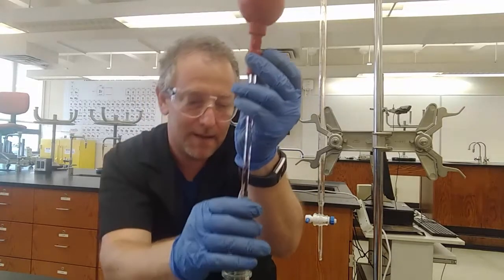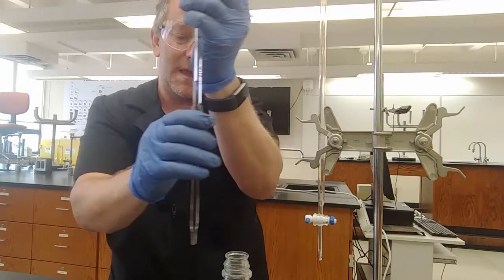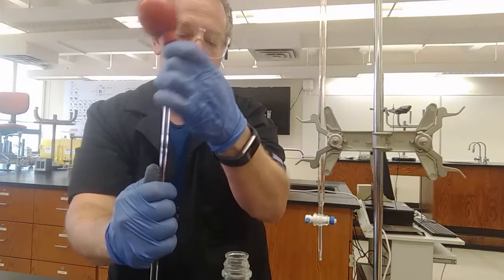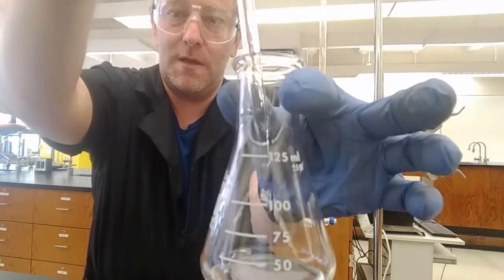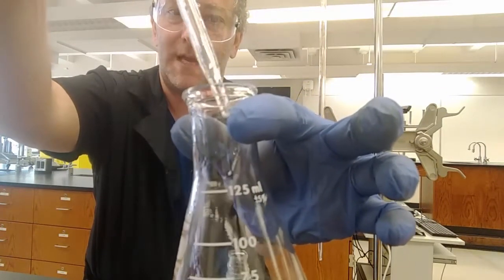Exactly on the line. Carefully take it out, no letting any air bubbles in, no letting anything out, and into the first flask. This is TD, to deliver. I'm letting it drain on its own. I touch it to the side of the flask to get anything off of the tip.